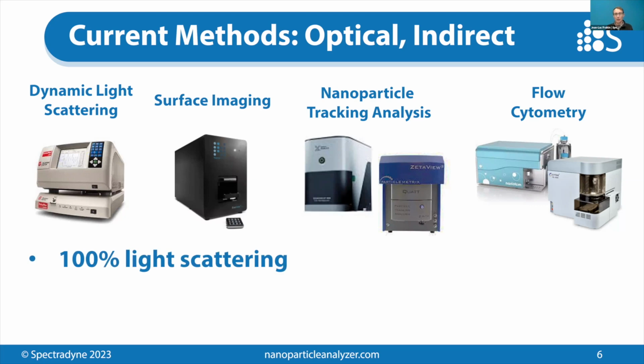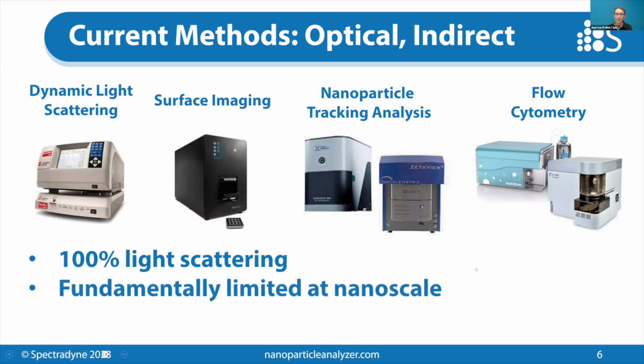If you look at all of these examples, what are out there are essentially light scattering instruments. So every one of these technologies is using light scattering to detect or measure the size of the particles. And that technique is fundamentally limited at the nanoscale basically because of fundamental physics, right? The particles are smaller than the wavelength of light, and so it gets harder and harder to measure them as they get smaller.